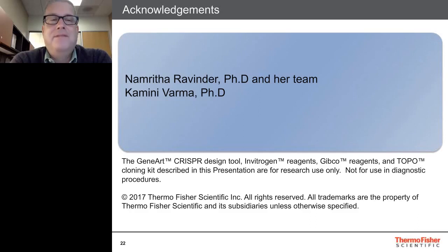Yes, so next generation sequencing can be very valuable for screening and for subsequently examining the effect of your mutations downstream of that. The issue with next gen sequencing is that the workflow is often kind of complicated, the data analysis is also complicated, and it can tend to be kind of expensive as well.